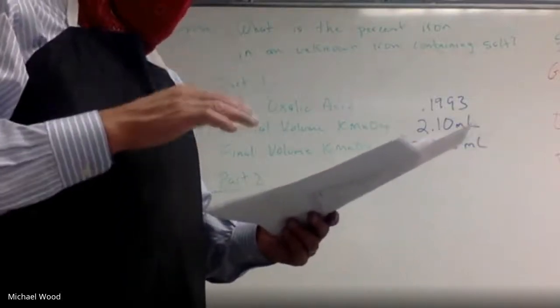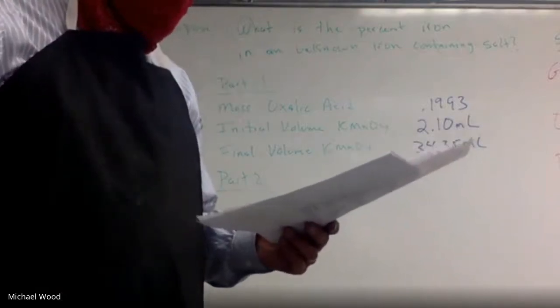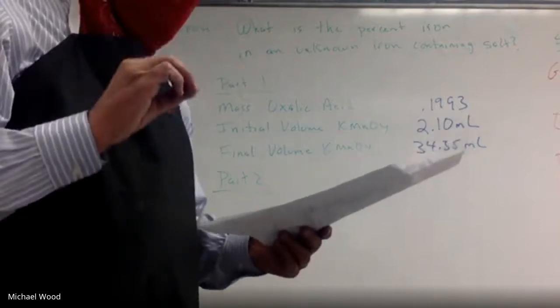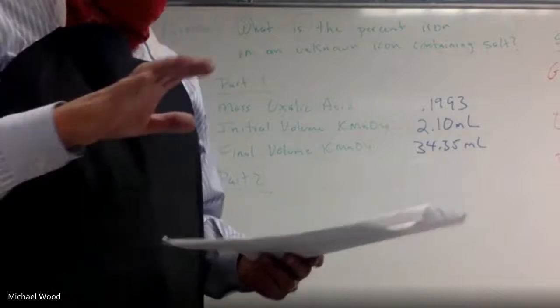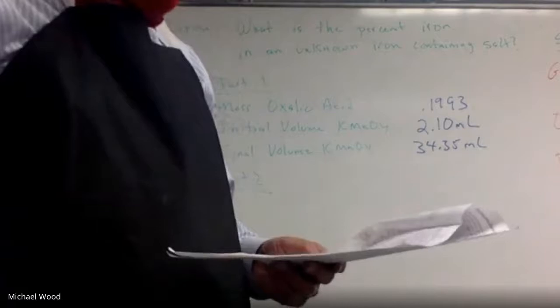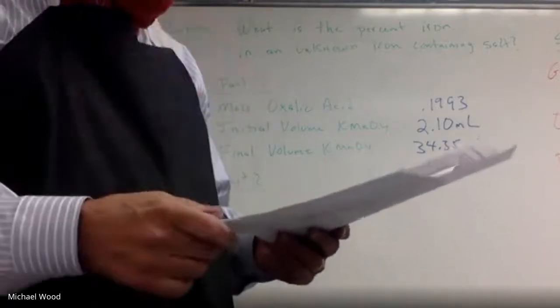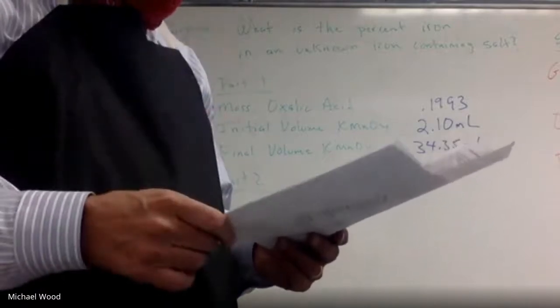You're going to get 60 mils of distilled water, 30 mils of sulfuric acid, which I did today. But we're going to add to this 2 mils of syrupy phosphoric acid. This is going to be not diluted at all. And I'm going to show you how to get that with a pipette on Monday, Tuesday. And we're going to do that in the hood. But you definitely want goggles on and apron. And then this one will just be at room temperature, so you don't need to heat it.